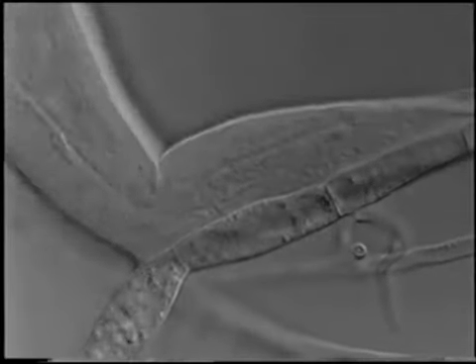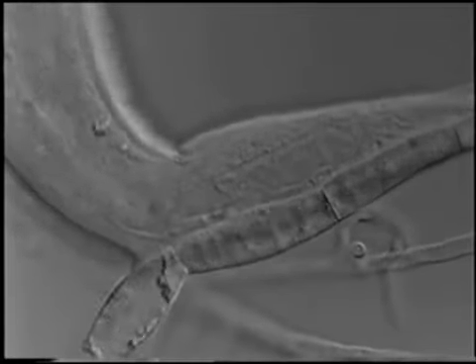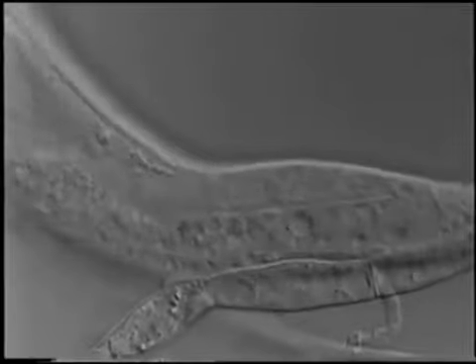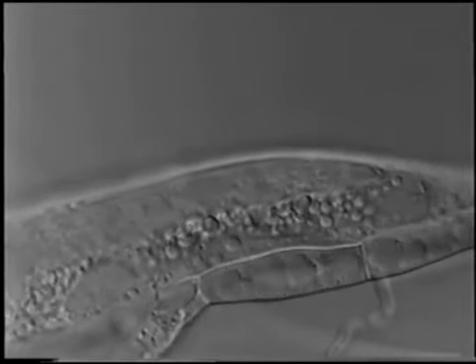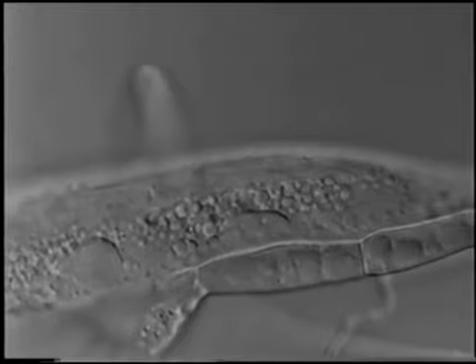During penetration of the cuticle, vacuoles accumulate in the trap cells. The movements of the nematodes slow down as the infection proceeds. The death of the nematode follows. Trophic hyphae develop within the nematode. A new trap is being formed outside.